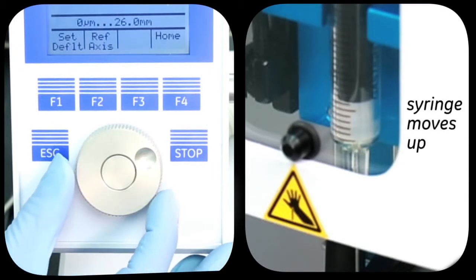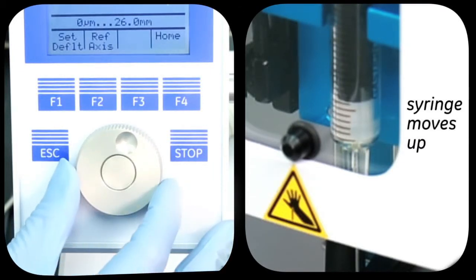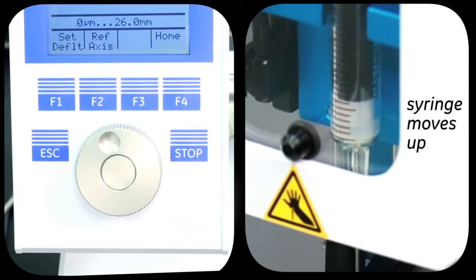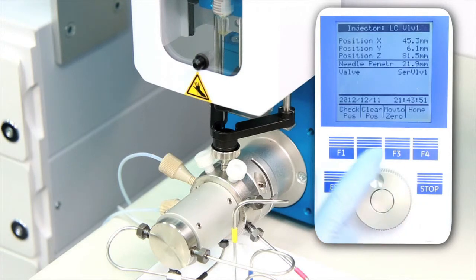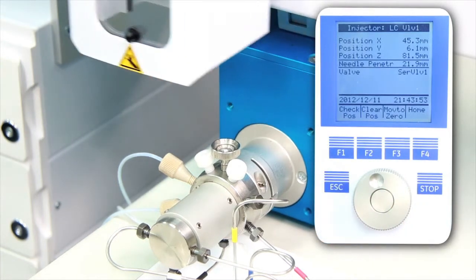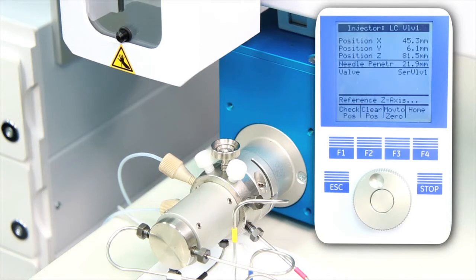At this point, rotate the outer knob two steps in the opposite direction. Then press Enter to save the needle penetration depth value. Press F3, move to zero, and that step is complete.